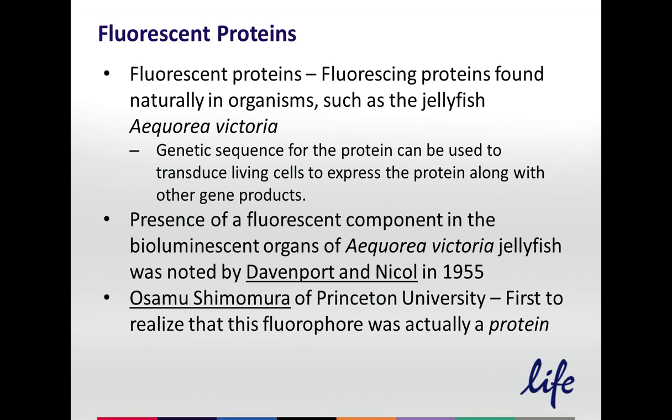Okay. The third class of fluorophores I wanted to mention were fluorescent proteins. Well, technically, the Phycofluors are fluorescent proteins in that they are proteins that fluoresce. But usually when someone says fluorescent proteins, they mean GFP or RFP or some similar one that can be sequenced and then have the sequence expressed in live cells associated with a particular protein. So it's a transduction method to cause your cells to fluoresce.